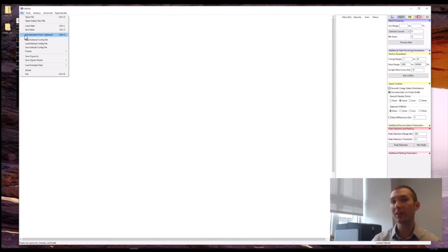So it's pretty simple to get it out. And we use this on the instrument all the time. We have the data collection open, we have UniDec open, and we just quickly copy paste between the two. When we're ready to do more thorough data analysis after we've collected the data, UniDec will open mzML. It'll open text files where you just have an XY list of the mass and the intensity. It'll also open Thermo and Waters data, but you're going to need to install some special libraries from them to be able to convert it.